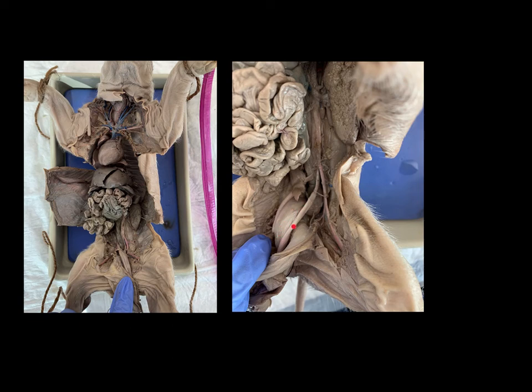And there are two vessels that run alongside that urinary bladder, and these are the left and right umbilical arteries. Umbilical because down here we can't see it, but this is where the pig's navel, the umbilicus or the belly button, is found. So this is the left and right umbilical arteries. So that's all the vessels that we need to know on the fetal pig.